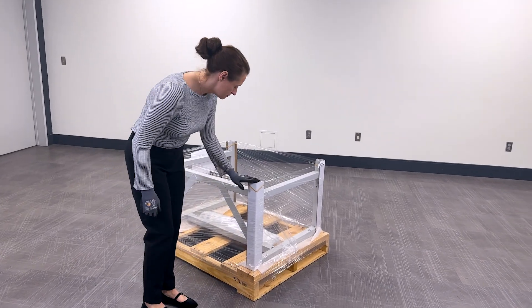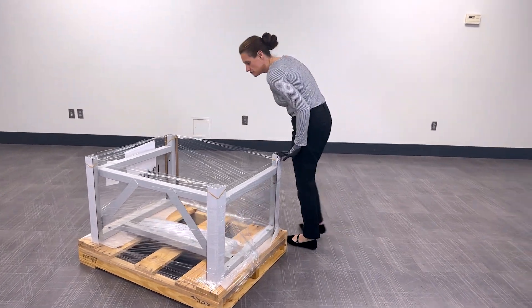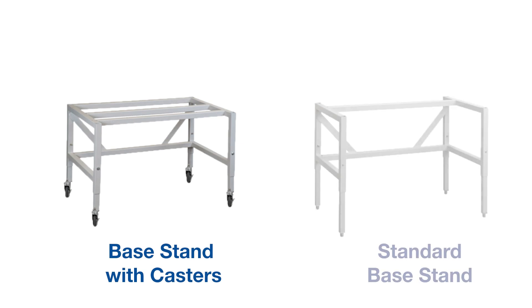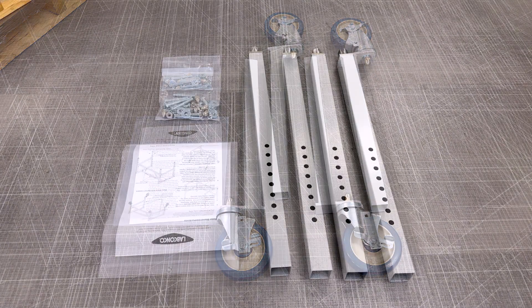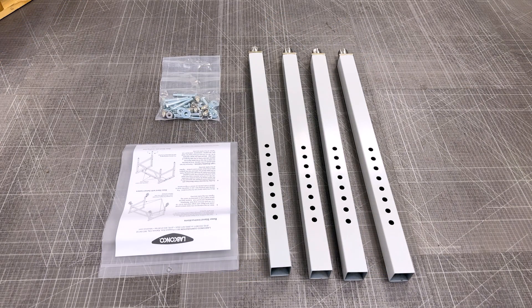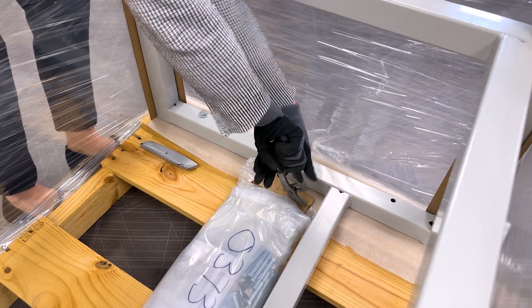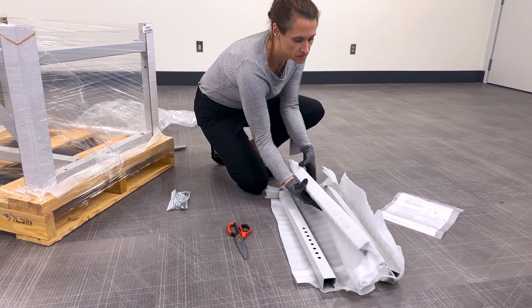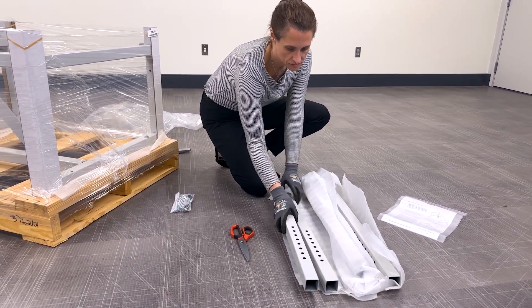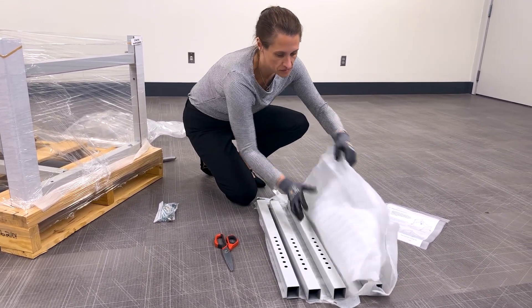Next, if a telescoping base stand or base cabinet was purchased, inspect the package and unbox. This video features the assembly of both a base stand with casters and a standard telescoping base stand. Casters arrive factory installed. Models with casters include four standard leveling legs. Legs are packaged inside the base stand and secured to the pallet. You should find four legs and associated hardware — unpackage and set aside, taking special care not to scratch the legs.